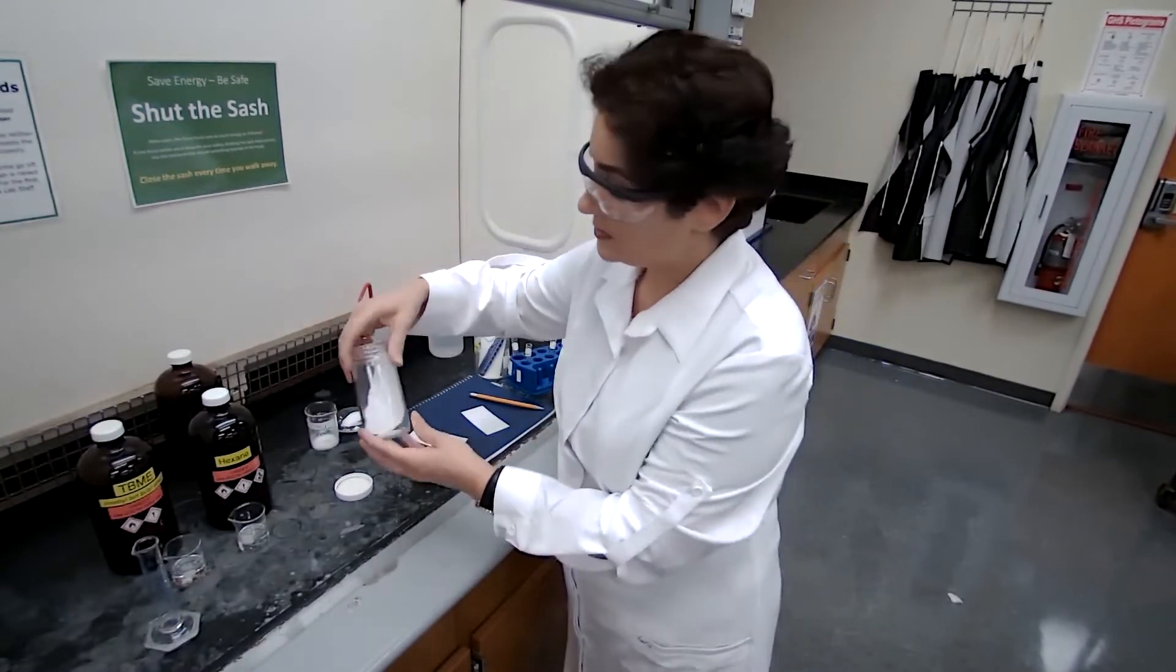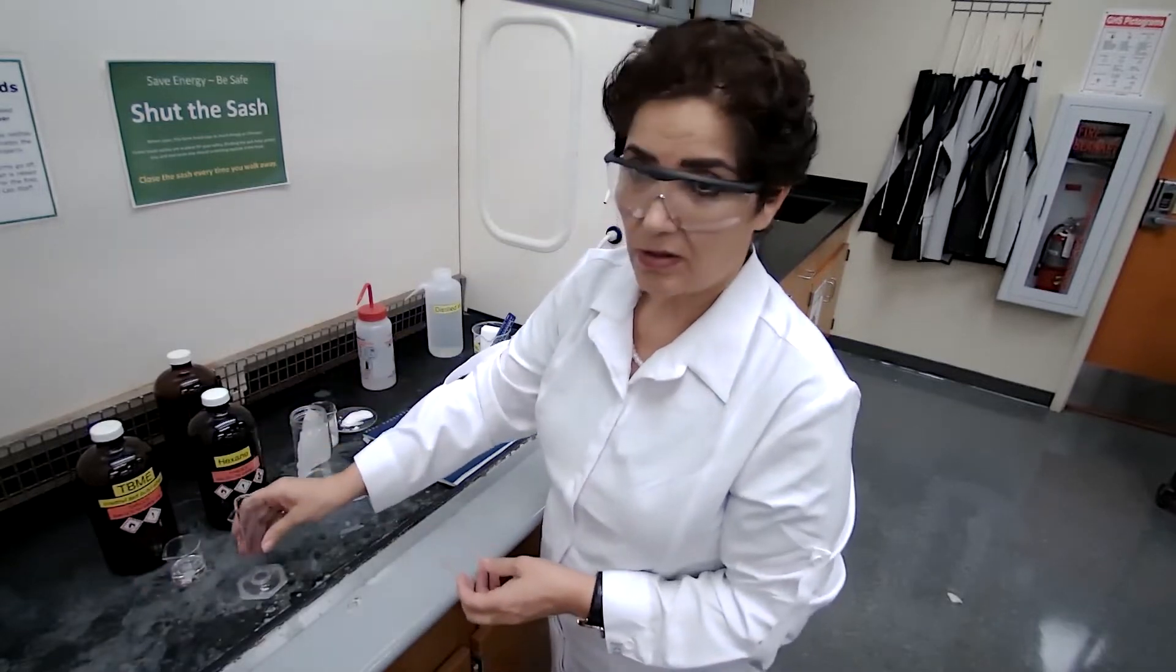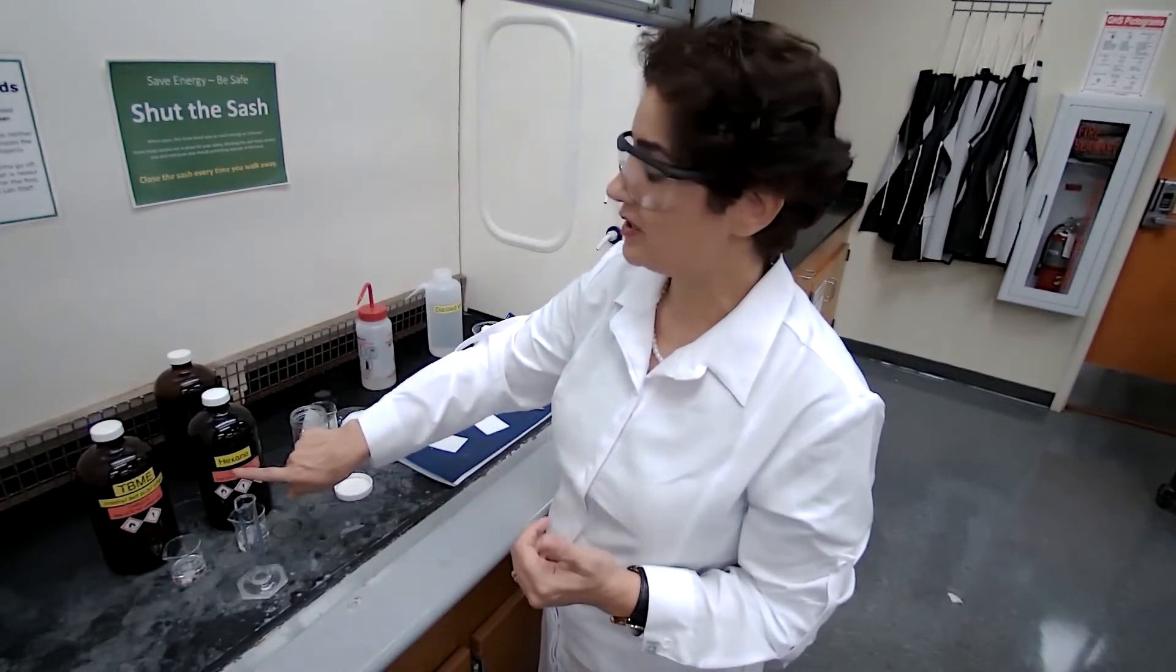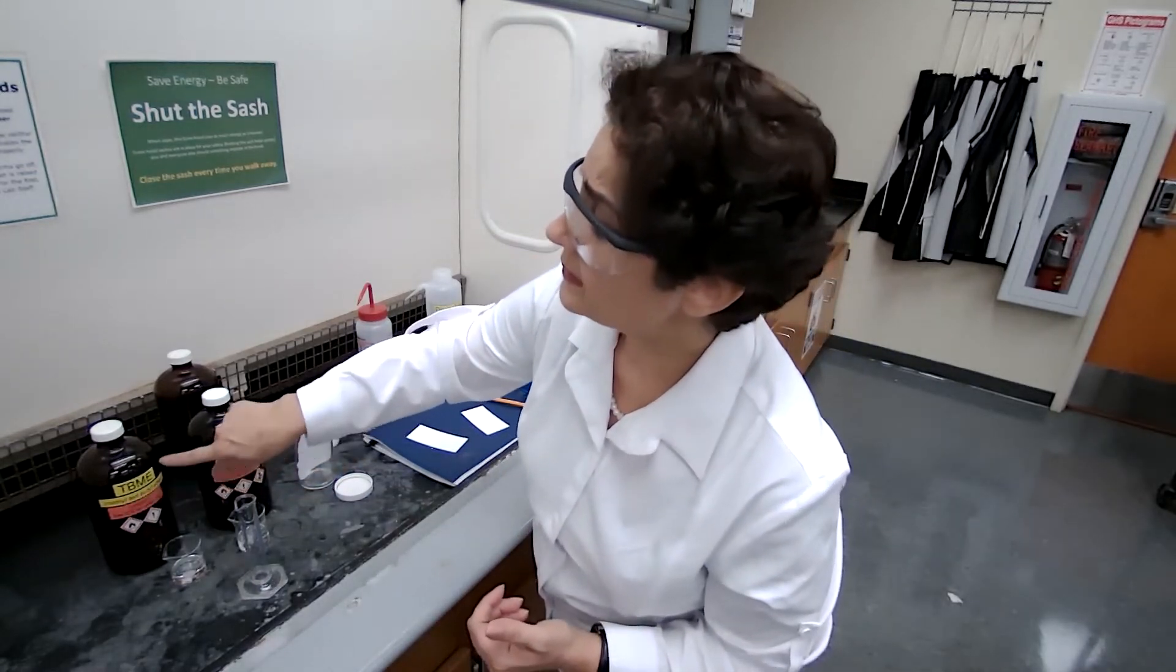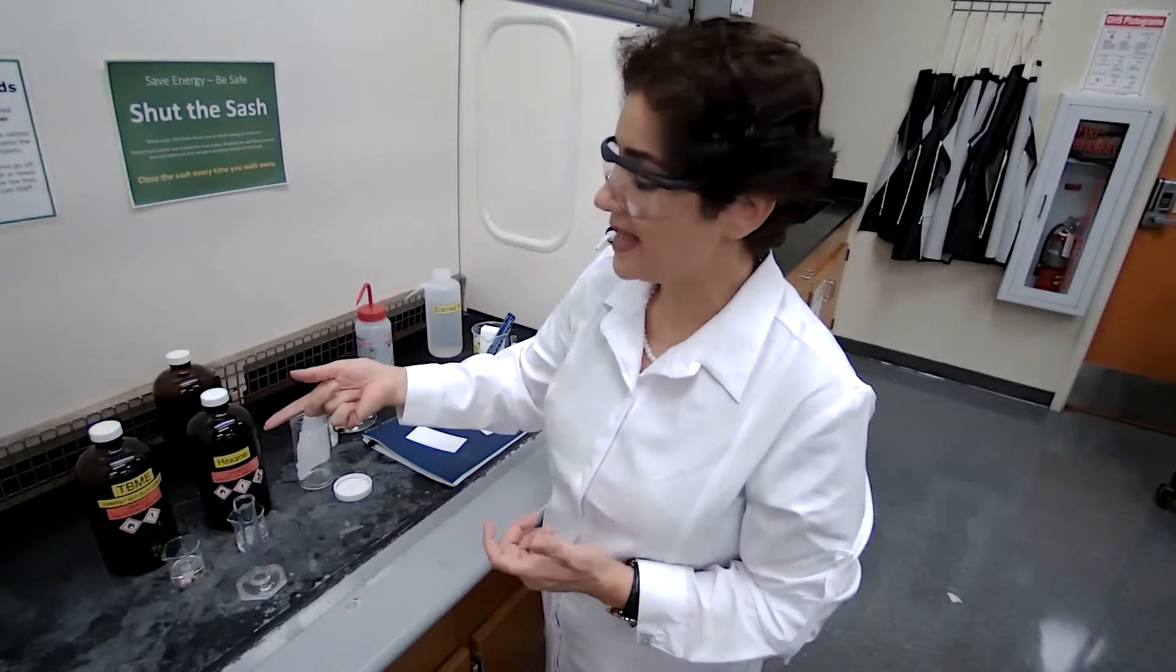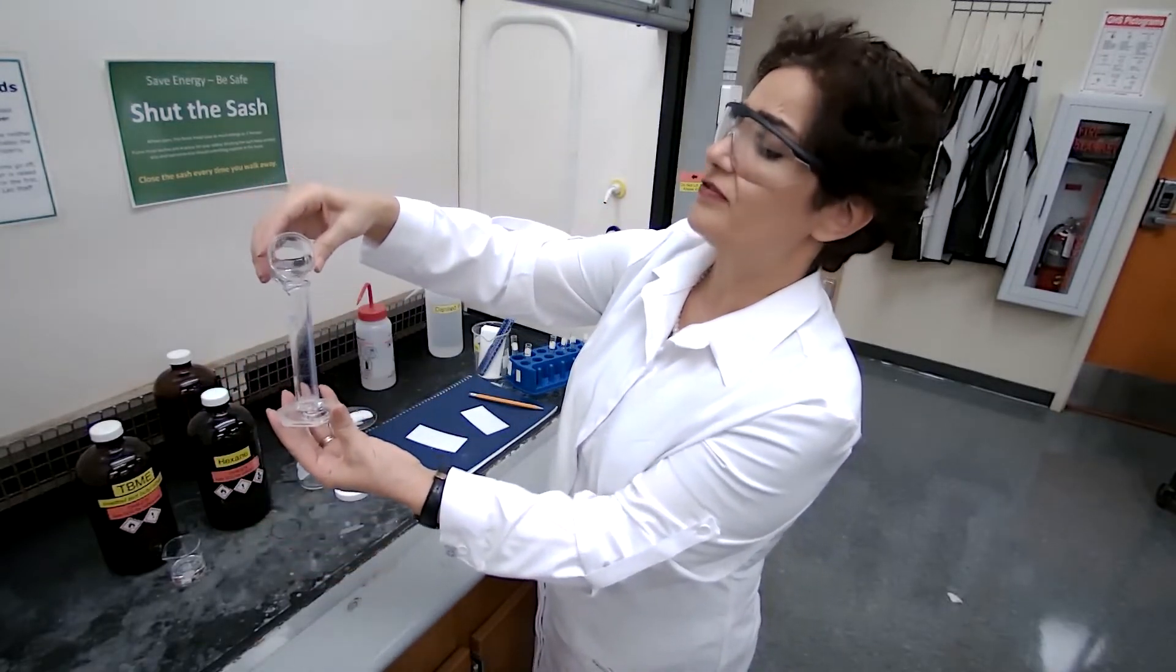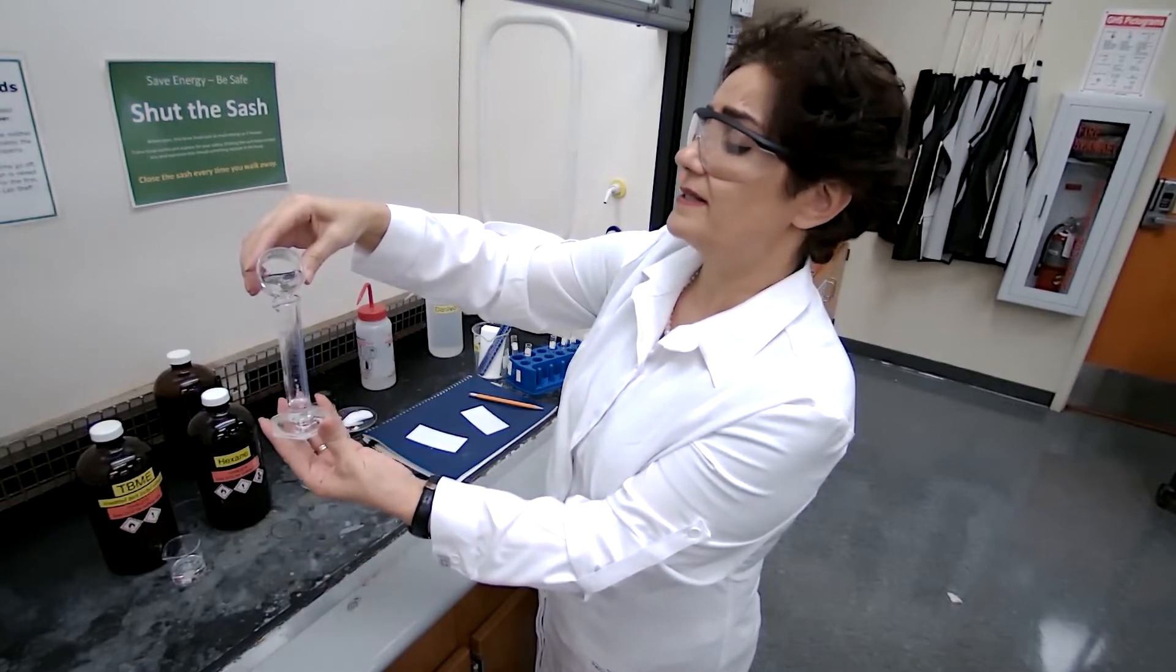And the solvent or mobile phase in this part is a mixture, 50-50% mixture of hexane and t-butyl methyl ether. TBME is the abbreviation solution for that. We are going to use five milliliters of each. I'm using five milliliters, I'm going to add the five milliliters of the hexane.